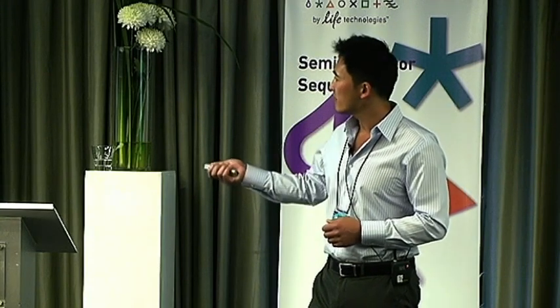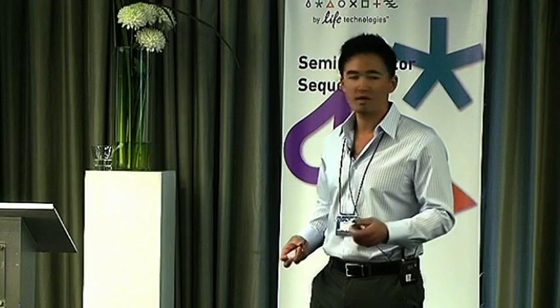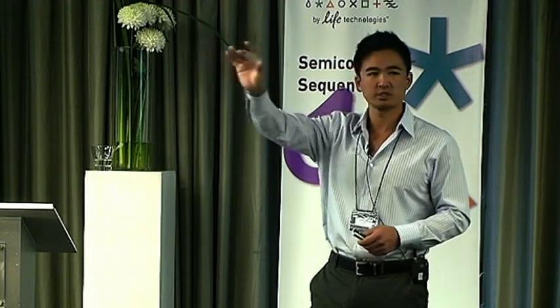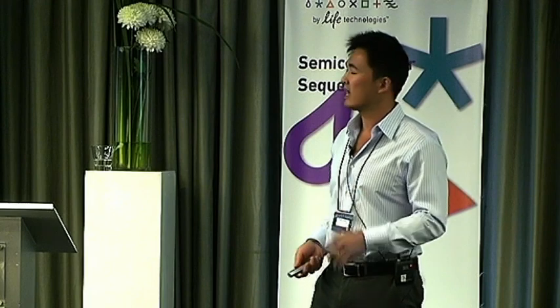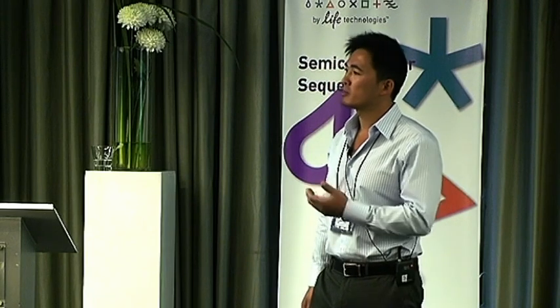So now with the advent of mid-density technology, and I'm showing you an image of an array there, the array itself physically, I don't have any to hand out, but I'm holding one right here in my hand. It's just basically the size of a microscope slide. So this array technology then would enable us to actually tackle both what we see here on the y-axis and the x-axis.